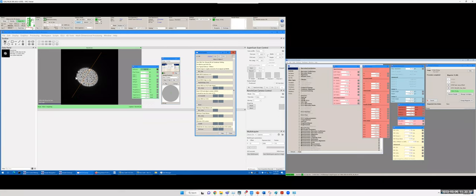And you can see that the MOA position is off center a little bit. So I want to put the VOA back in and move the MOA relative to the VOA. The idea is we don't want to see the edge of the MOA showing on the VOA. Okay, right now is good.